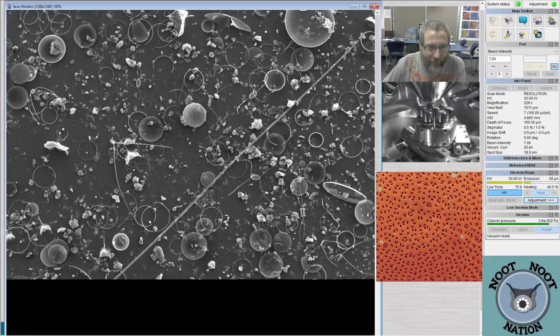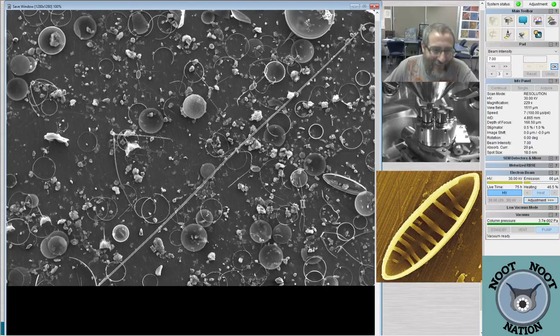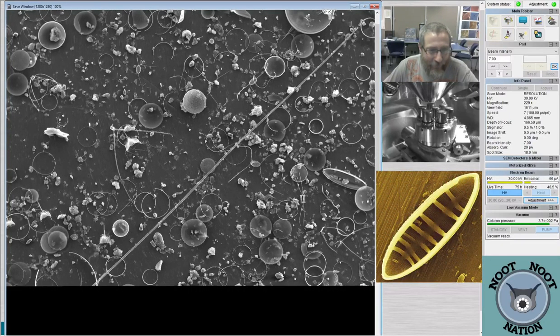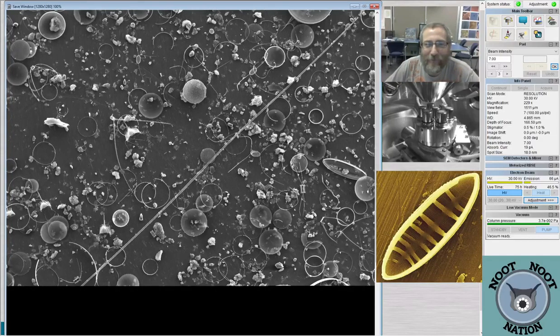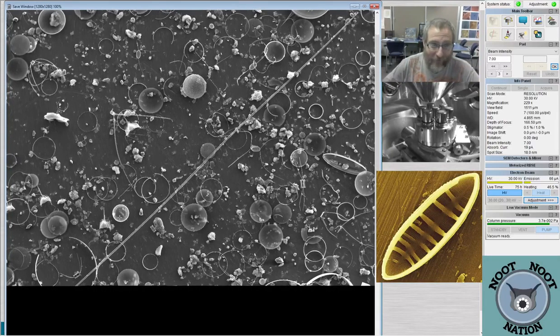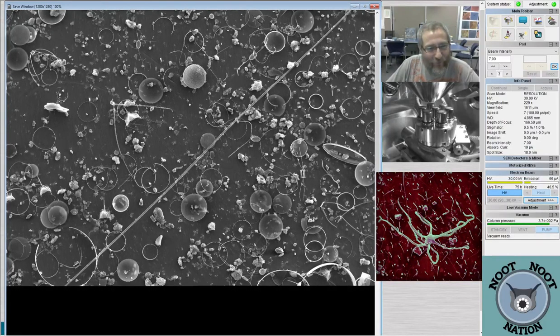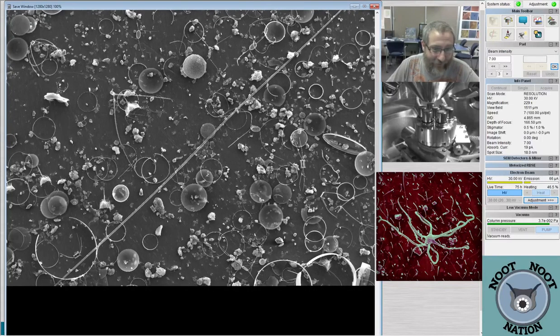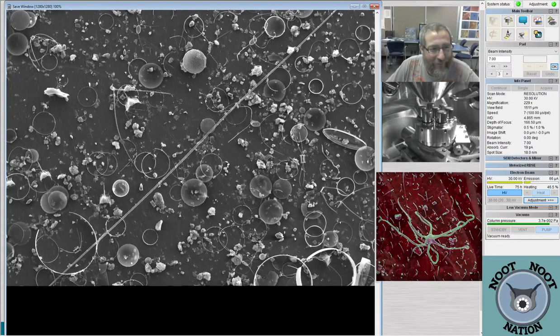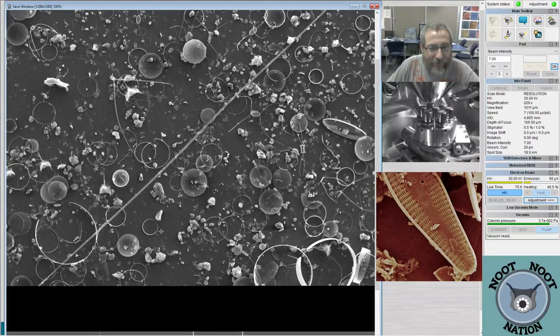And then this Thalassiosira that the giant diatom landed on also looks kind of cool to me. Just a bunch of stuff. I think maybe that's a Melosira. But looking at stuff from way out here is kind of weird, because on the SEM we're so used to being a lot closer. But in order to get this one, I had to zoom out basically as far as I could. I didn't have to lower the stage, so there's that. But we are crazy zoomed out for this one.